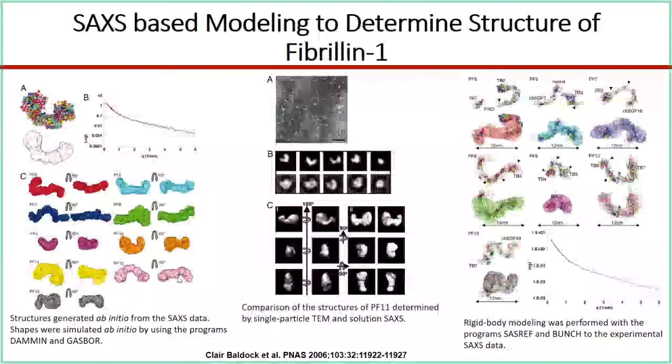One other thing that this paper actually brings to mind, and I must say, is just as you do 20 different DAMMIF or DAMMIN steps to make sure that you're getting a unique conformation, even SASREF or any of these simulated annealing programs must be run multiple times to at least check for reproducibility. Because what you're looking at here is they have overlaid, I think, between 5 and 10 different SASREF results, all of which, as you can see, agree with each other. So that, again, also goes into building confidence in what you're seeing.